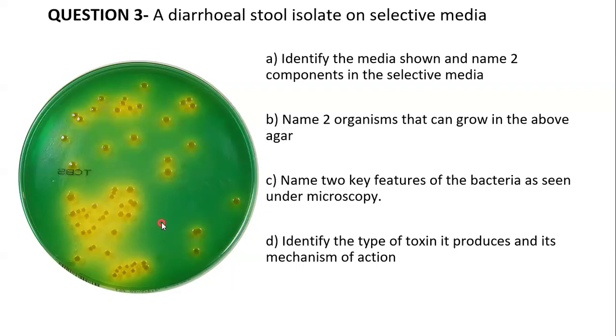Yes, what agar is this? It's very specific. Yellow, green background, and yellow pigments. What agar?